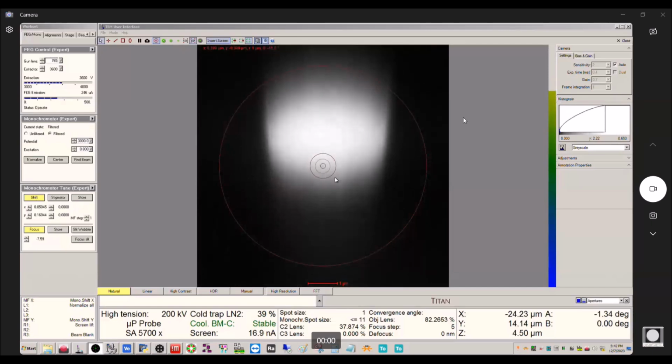So it's good after you excite this to just give it some time to stabilize. Otherwise, you're going to be chasing the beam around as you use it later for your imaging. So I'm doing this at the end of the day here on Thursday, and then Friday I'm going to come in and start doing it. So I'll have overnight basically to give this to stabilize. Okay.